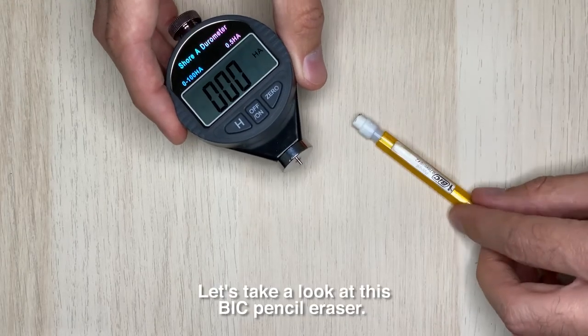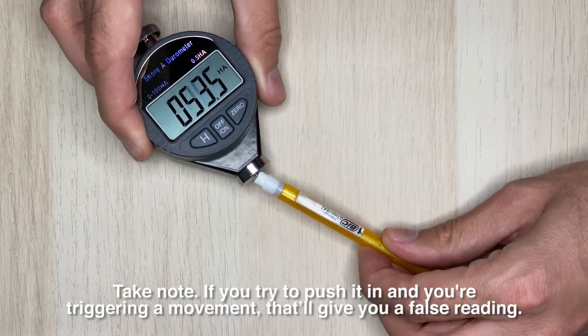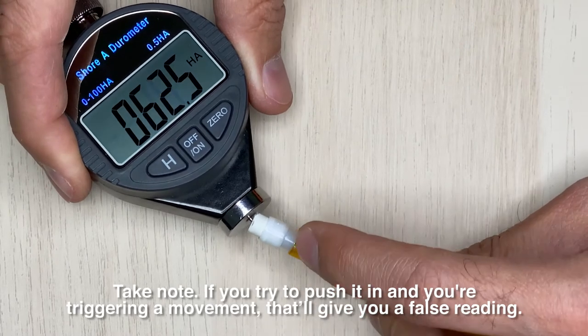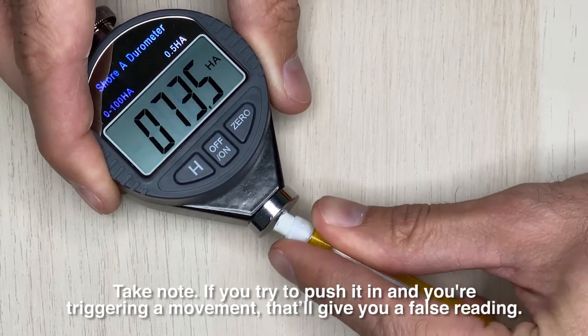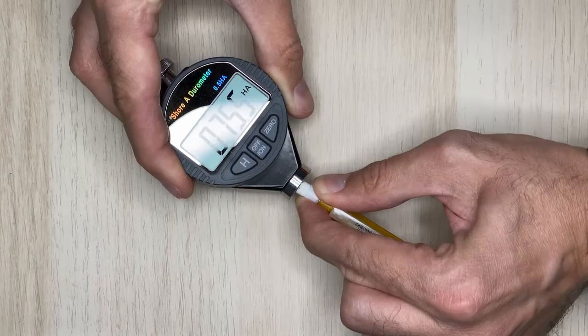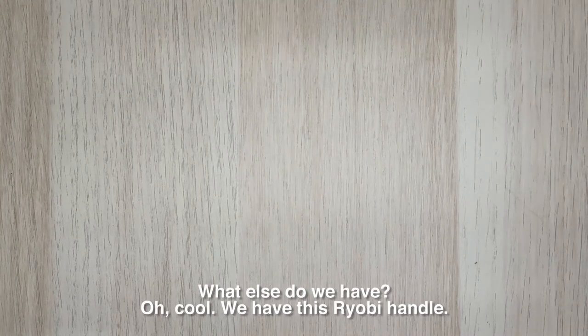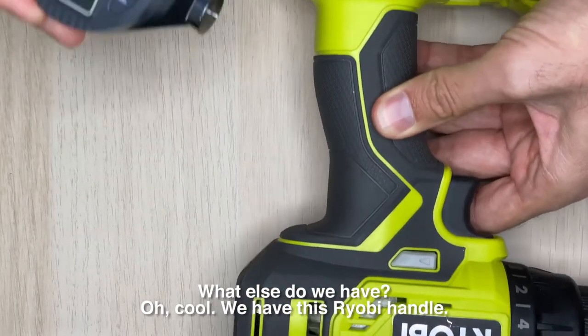Let's take a look at this big pencil eraser. Take note: if you try to push it in and you're triggering a movement, that'll give you a false reading. So I'm going to hold that down. Now I'm pushing it in — 75.